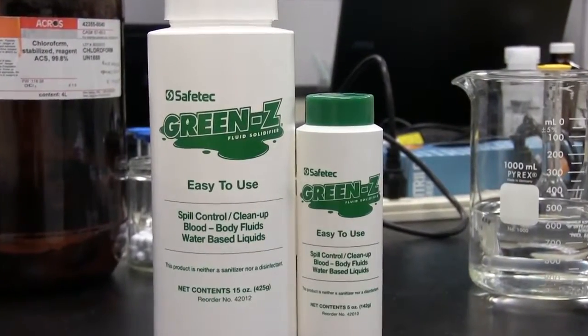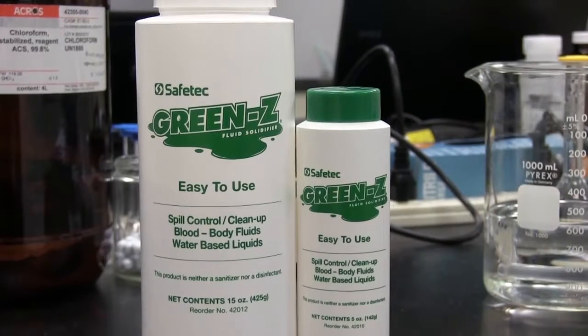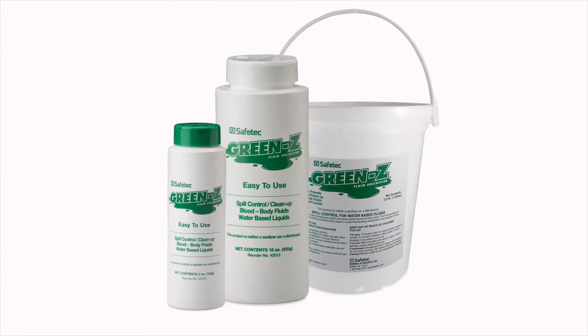A final benefit of Green Z is that it is a cost-effective solution for spill cleanup and is available in a variety of packaging options.